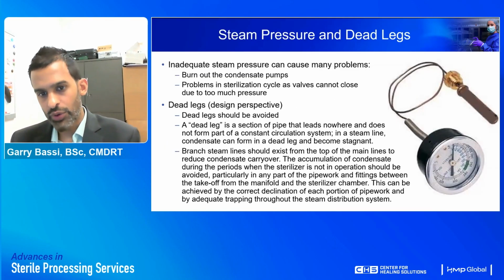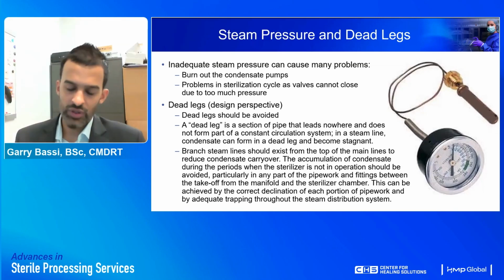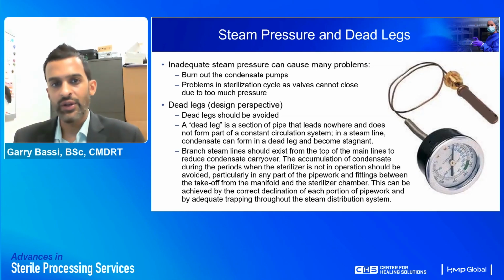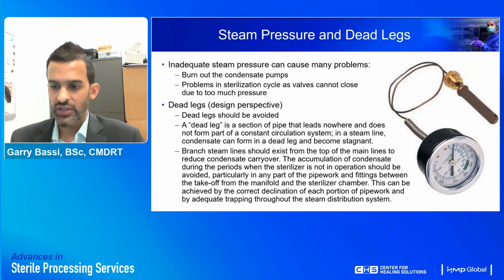Another thing that's important is steam pressure and dead legs when you're designing a steam sterilization department. Inadequate steam pressure can cause many problems, and particularly it can burn out the condensate pumps. Most of the time you'll see sterilization manufacturers recommend 60 psi steam delivery to the autoclaves.